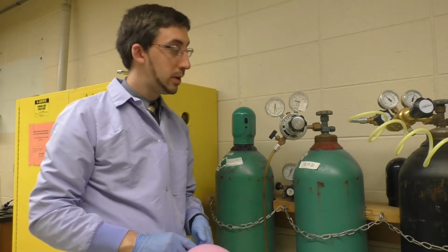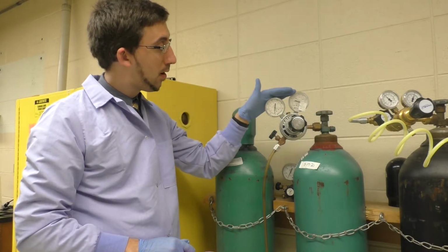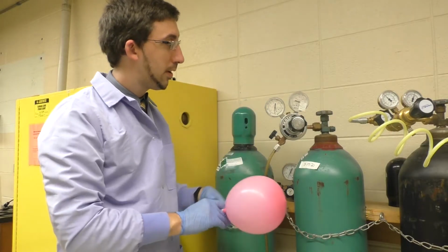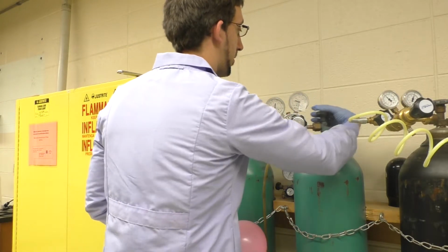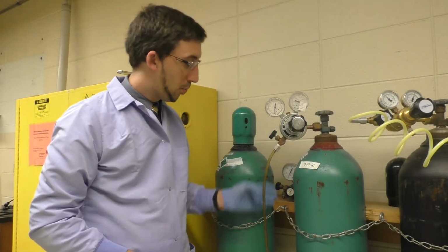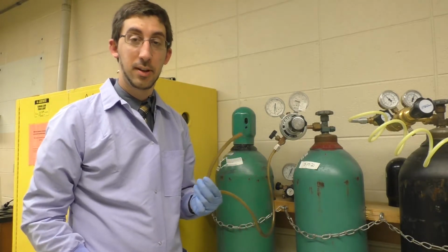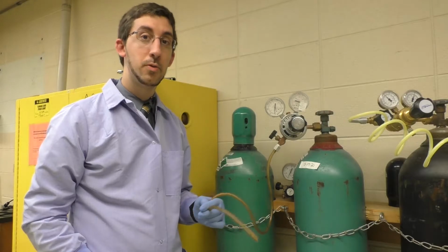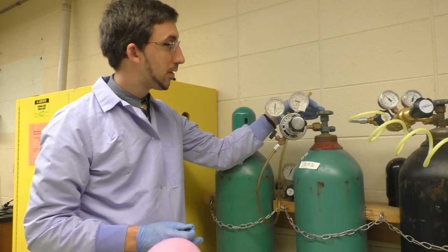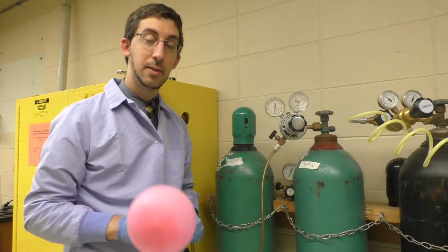And generally, if we weren't going to leave the tank on, which we don't generally want to do, I'd have to bleed off any excess pressure that's just in the line here by closing the tank and then opening this again and bleeding into something. Hydrogen's a pretty reactive gas, so I might feed it into a fume hood or fill up the balloon with the remaining hydrogen pressure that's just in the valves. So there we are. We've got a balloon set for the reaction.